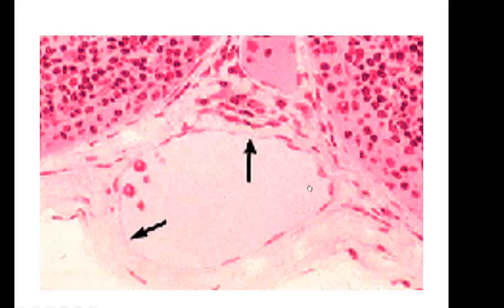Now these are also simple squamous cells. Here's a simple squamous cell, here's a simple squamous cell, here's another simple squamous cell. So here we're lining a structure, so you can see the very flat cells in here. And notice how the nucleus of simple squamous cells are nice and squashed and flat. Don't worry about all this other stuff out here. These are what simple squamous cells look like.